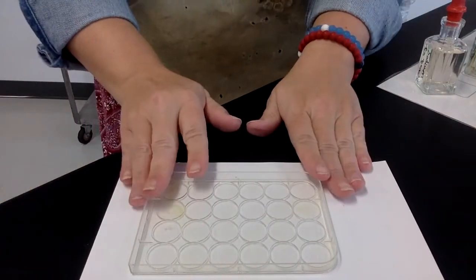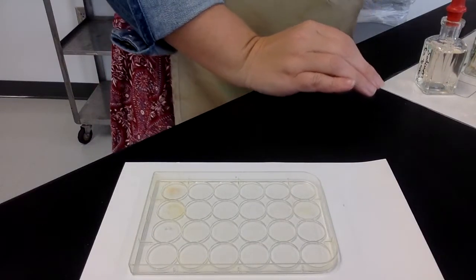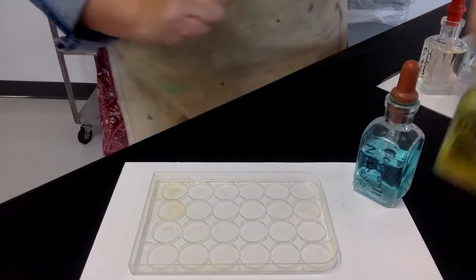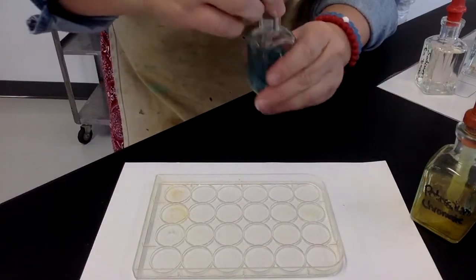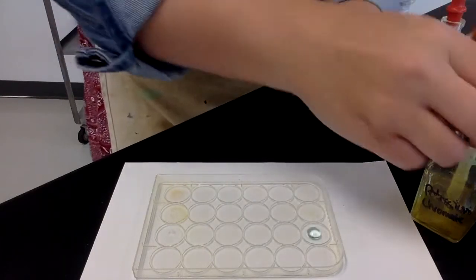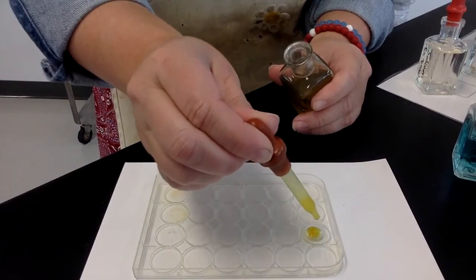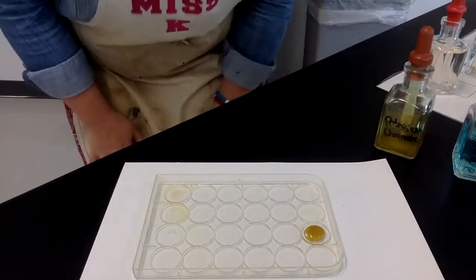So this is our well plate so that you can see what's going on. We're doing reaction number 1, which is copper nitrate and potassium chromate. So what I'm going to do is mix 2 to 3 drops in each little well. And then we'll be able to see what happens. So like 1, 2, 3. So there we go. And then 1, 2, 3. Okay. Definitely we're going to call that a precipitate.